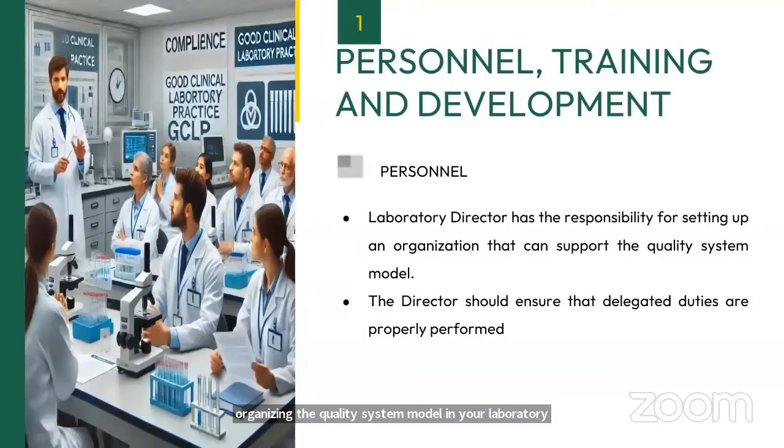The director should also ensure that delegated duties are performed properly. So if the laboratory director has delegated some duties to some personnel, for example, blood collection is carried out in your phlebotomy area, there may be one phlebotomy person or supervisor who is doing those responsibilities. So delegated duties are there for this supervisor.